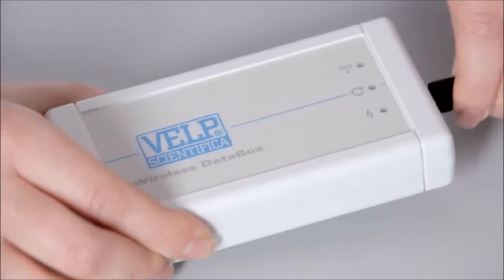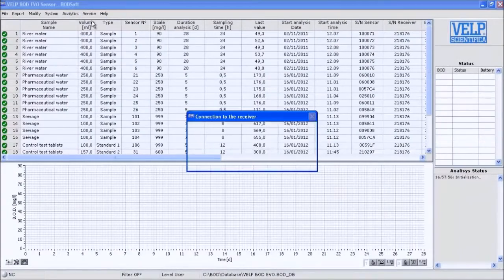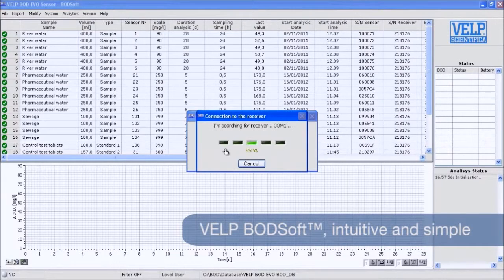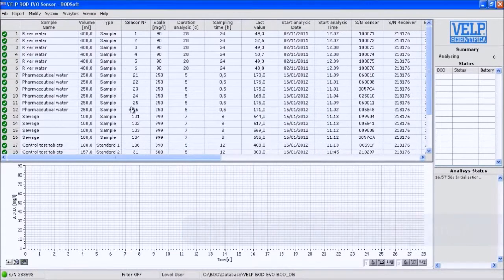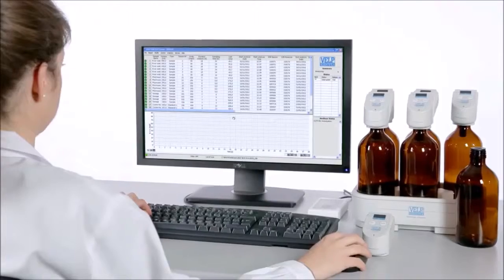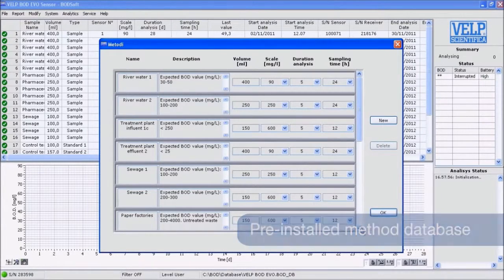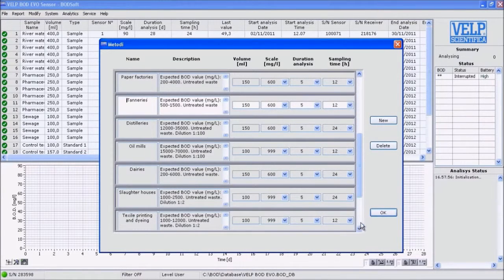BOD Evo is entirely controlled through the dedicated BOD Soft software. Intuitive and simple to use, it is available in different languages to facilitate communication. A pre-installed method database, according to the most common applications, simplifies user activities.